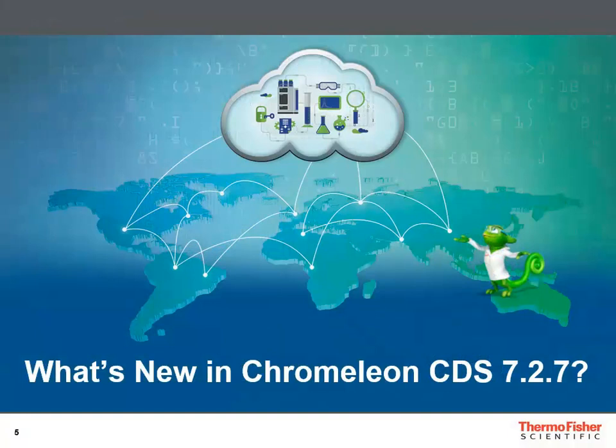So what is new in Chromeleon 7.2.7? Let's look at what's new for instruments and updated instruments, and then we can look at the new features.